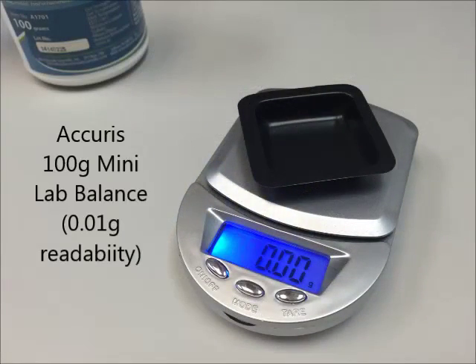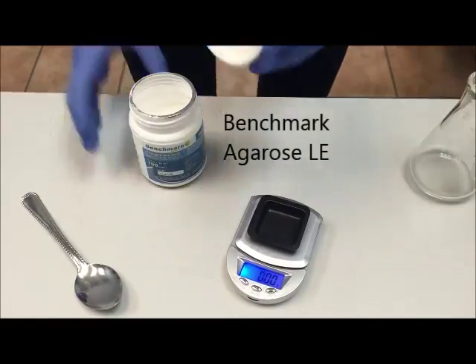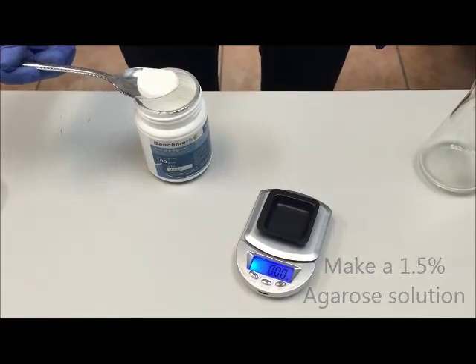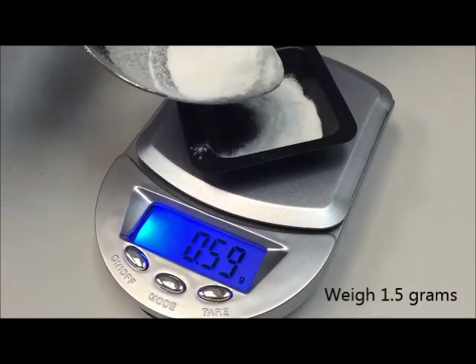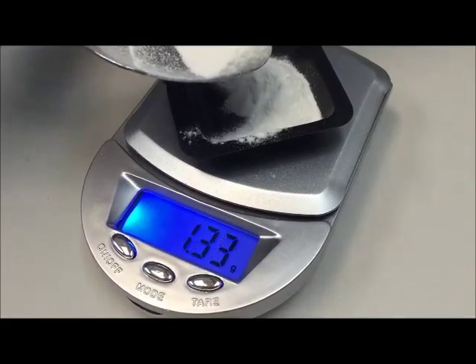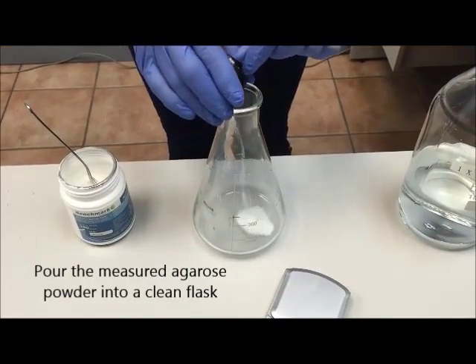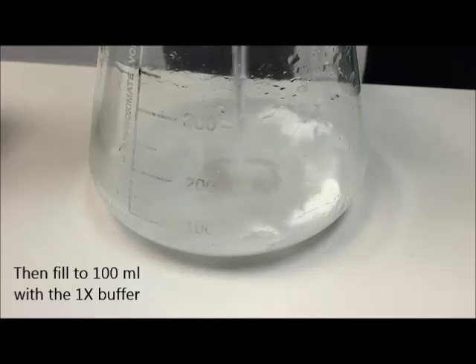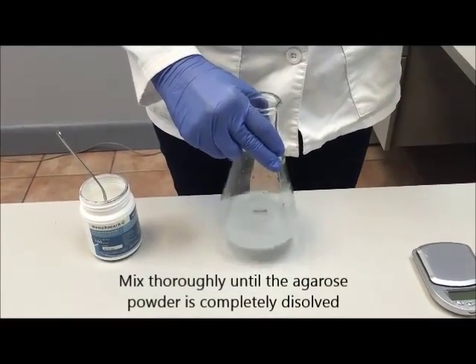The next step is to make our agarose solution. We're going to be using the Acuras 100G Mini Balance to weigh out some agarose powder. We're making a 1.5% agarose solution, which is suitable for the size range of DNA we'll be separating. First, we weigh out 1.5 grams of agarose powder. Add some of our 1x buffer to bring the volume up to 100 ml. It's very important to mix the solution thoroughly so all of the agarose powder is completely dissolved.